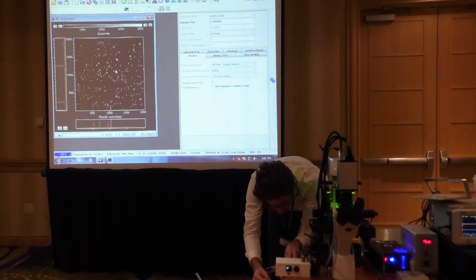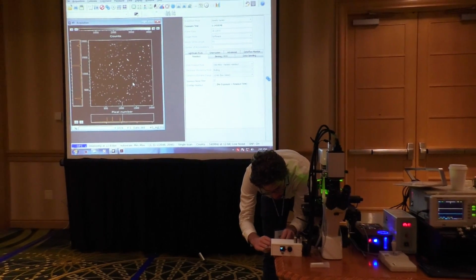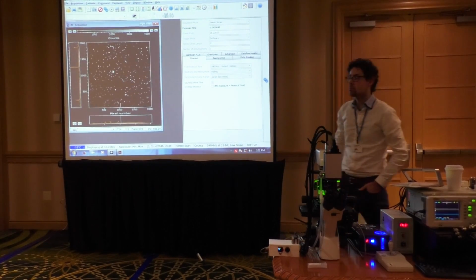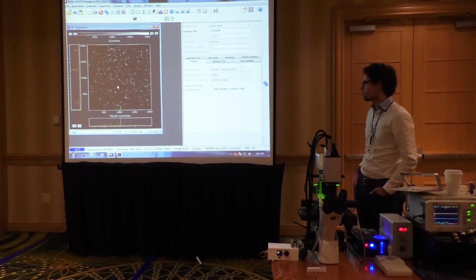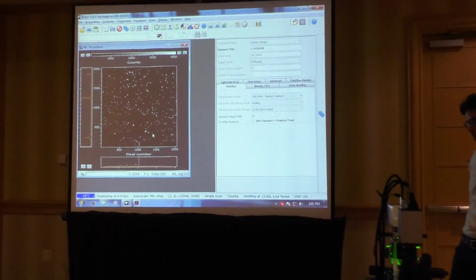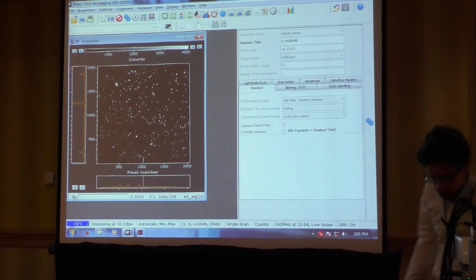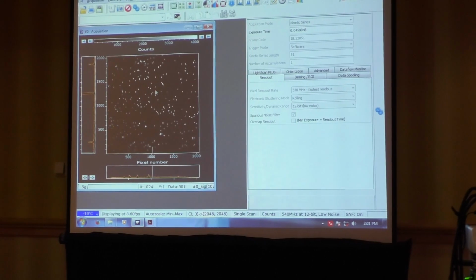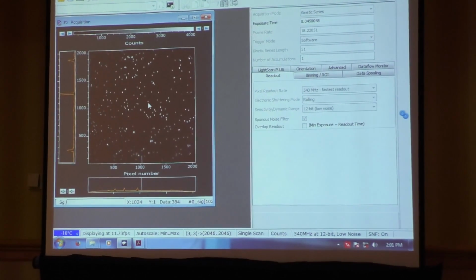Now, this is a picture, and this looks bad, right? Like, these are little dots. They're all about 500 nanometer spheres. And if we look out of focus here, there seems to be some sort of a spherical pattern back here. This area looks somewhat okay. So what's going on here?